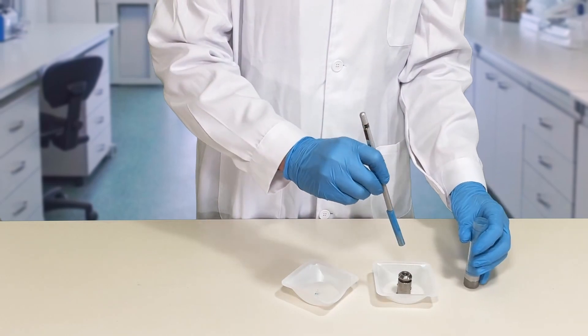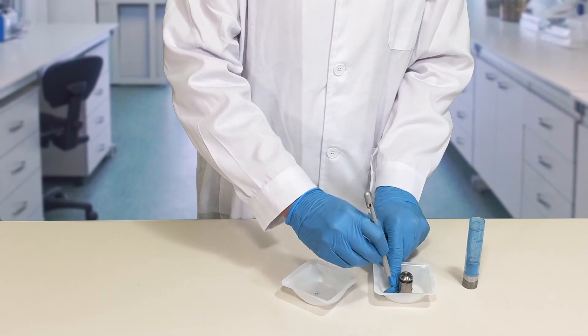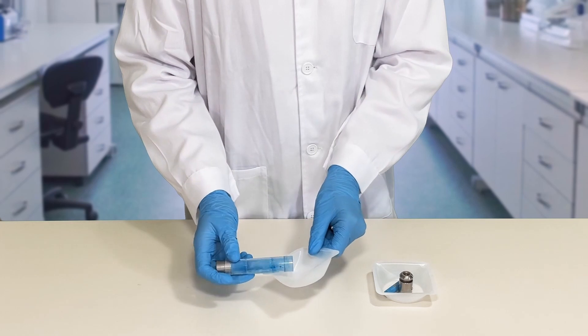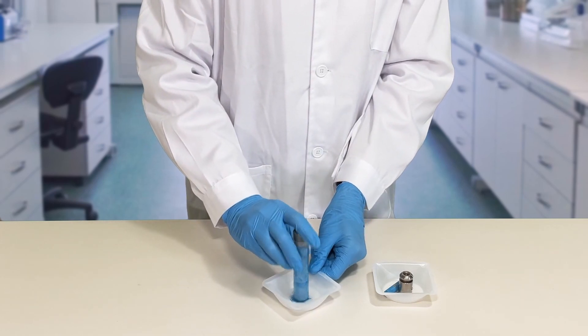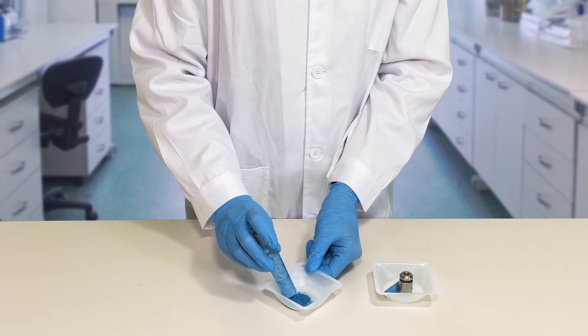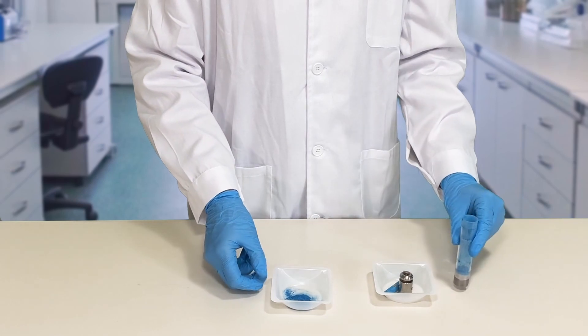Did you notice the color change of the material? The API, in our case, had a distinct blue color, which was uniformly distributed within the formulation by the milling action. This uniform mixture is the perfect starting material for the VCM process to obtain uniform and homogeneous ASDs, as with any other method.